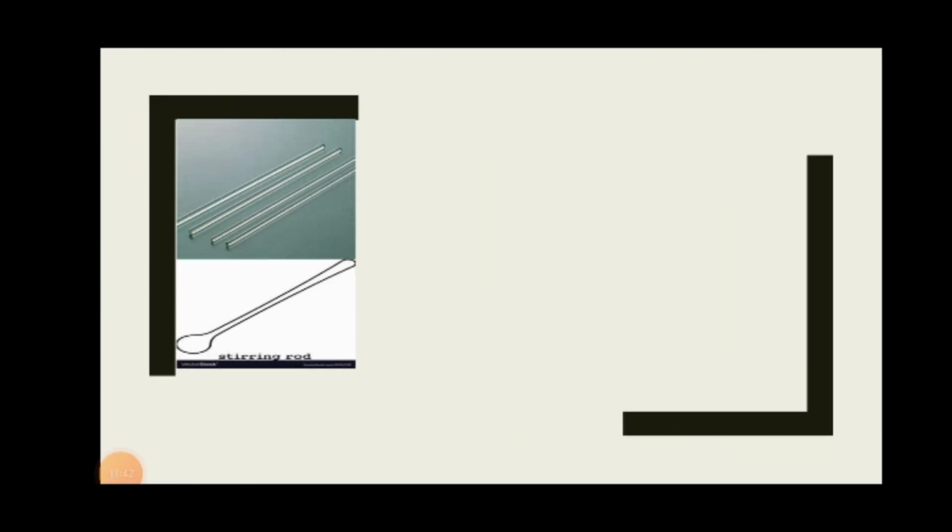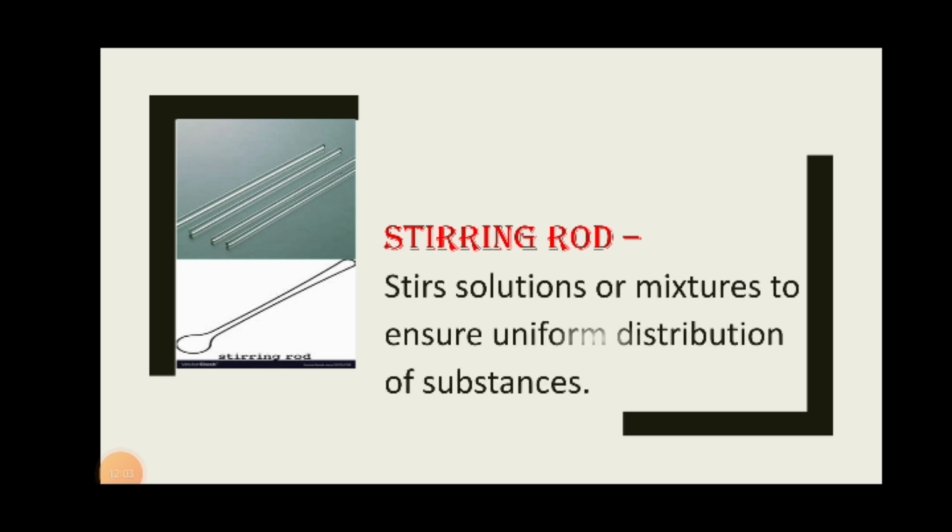Yes, stirring rod. Stirring rod appears just like in the picture, but other stirring rods have something like a spatula at the tip, no? Pero the basic figure of stirring rod is yung stick lang talaga siya. Ano ba nga? Stirring nga eh. So, pang-stir siya to solutions or mixtures to ensure uniform distribution of substances. Yun yung function ng stirring rod.